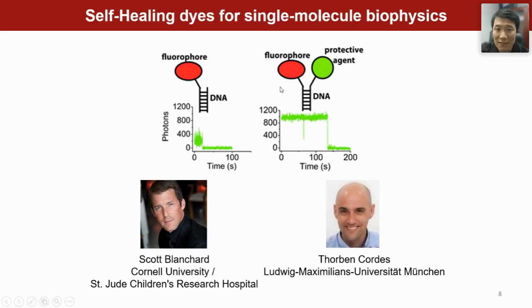because actually with this kind of TSQ-conjugated dye, when conjugated to proteins for single molecule tracking, it's not much better than solution-added protective agents, because you can have maybe even millimolar or 10 millimolar protective reagents in the buffer. But in live cell imaging, if you want a fluorophore to be protected inside the cell, you have to use this covalent linking strategy. But at that time, before us, no one really considered using this strategy to do live cell imaging.